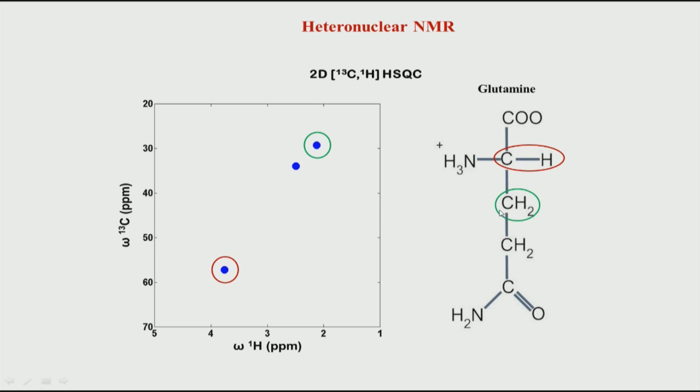So, it is upfield shifted, but compared to this hydrogen carbon pair, here it is now an amide. So, it is again an electronegative electron withdrawing functional group. Because of this, this pair comes downfield shifted compared to the other. Downfield means it is shifted down both in carbon and in proton. So, this is why this CH pair comes downfield shifted and it is around 2.5. This is how the spectrum of a simple molecule like this will look in HSQC.